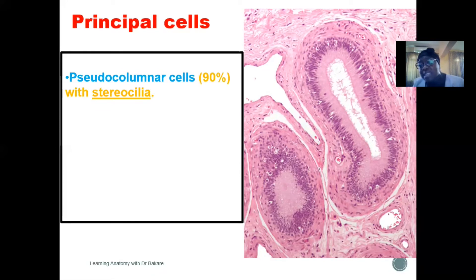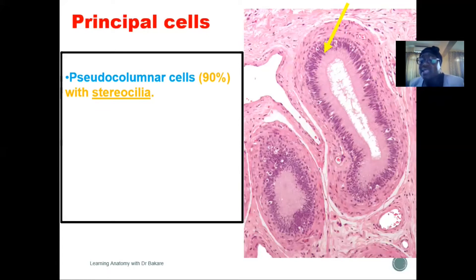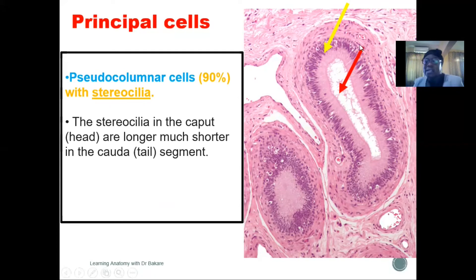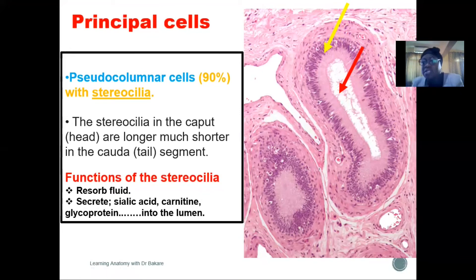They are pseudo-columnar epithelium with free surfaces seen with stereocilia, with a high capacity to secrete and also reabsorb fluid. The free surfaces are seen with elongated microvilli referred to as stereocilia. Stereocilia within the head region appear to be longer than what is seen in other parts of the epididymis. The stereocilia are pushed towards the lumen, and their functions include helping to reabsorb fluid and to secrete fluid into the lumen.